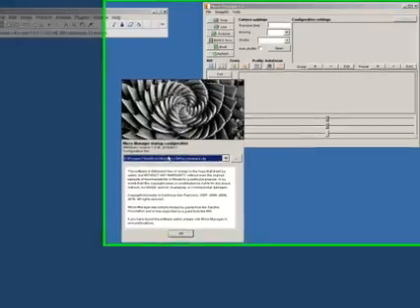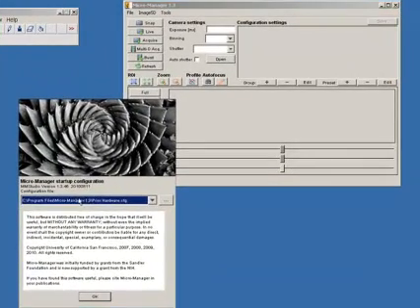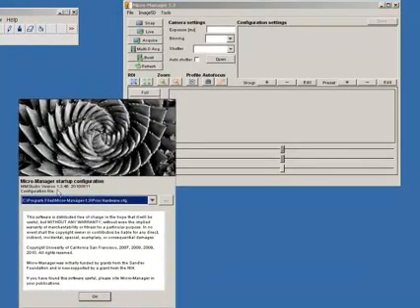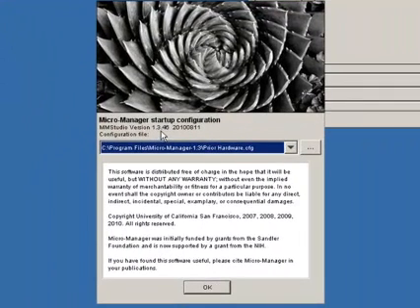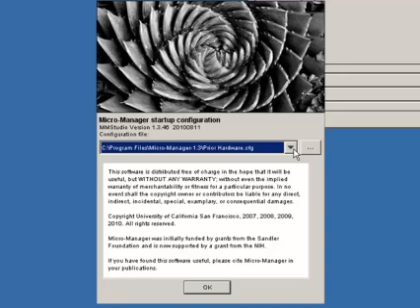I've downloaded the latest version of Micromanager from the website and I'm running version 1.3.46. On the system at the moment I've got a Photometrix CoolSnap HQ2, I've got a prior ProScan 3 which is running an XY stage, focus drive, excitation filter wheel and a shutter. Obviously, the first thing you're going to need to do is also make sure that you've got the latest version of pvcam running to control the CoolSnap which can also be downloaded from the Photometrix website.